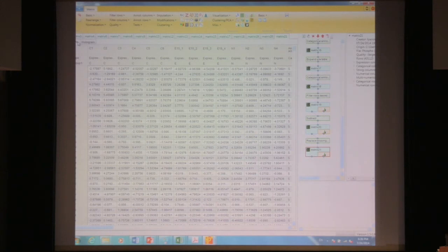Is this described in the literature anywhere? That's something that we came up with, and I don't think we have it in any publication yet. We should. The description is very simple. But if I go home and start using this imputation, I'm going to get into trouble with a lot of people.